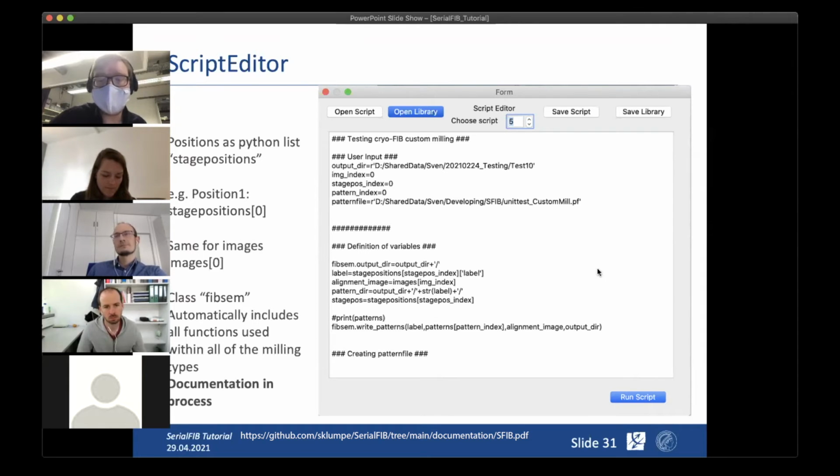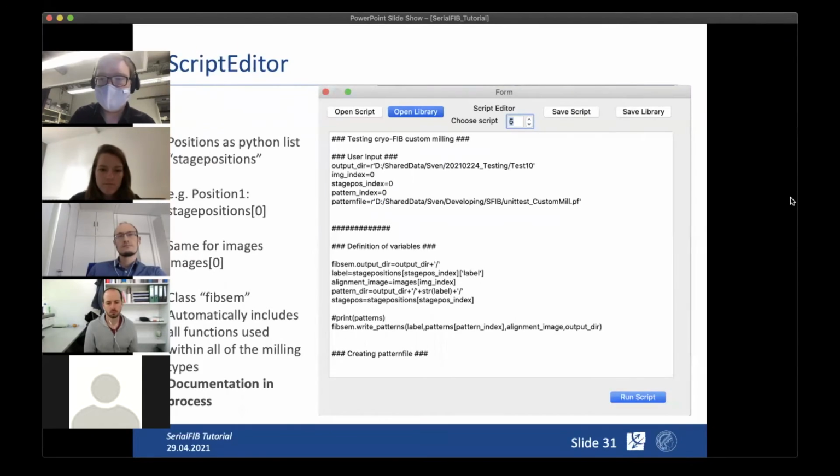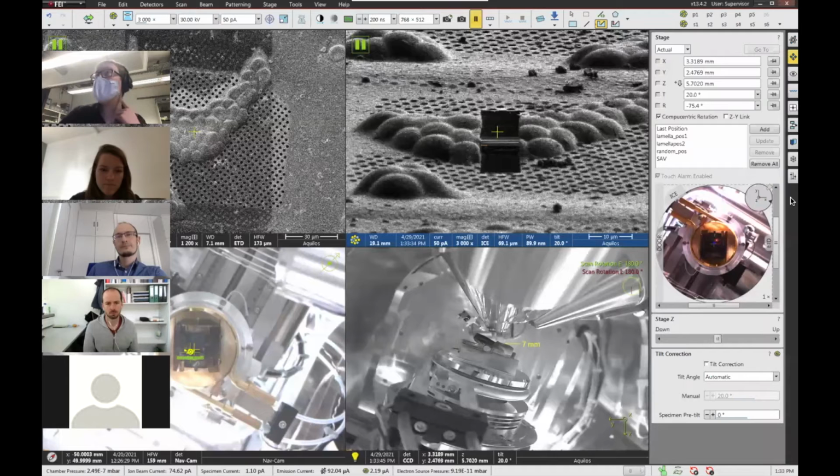What it does internally is simply write a file together with a pickle with the images, etc., that is then just run. So this Python script that is written out with the images is then simply taken for the option. Sorry, I got distracted because the fine milling is done.